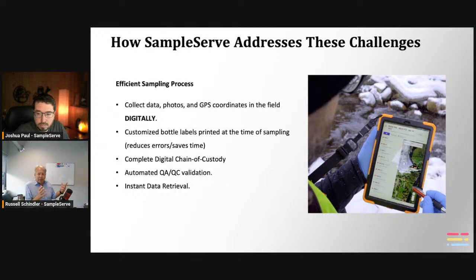confirming, like, hey, it's raining out, so I left my tablet in the truck. So I'm 70 feet away versus outside of the 50-foot range. So there are reasons where you may need to be outside of it. So we've covered all those bases. You just write a little note while you're outside that range and then proceed with the sampling. So that's the digital chain of custody, and it's better than paper because there's no changing the data.